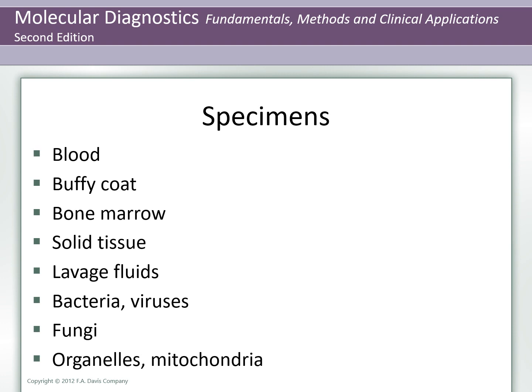Fresh or frozen tissue samples must be dissociated before DNA isolation procedures. Grinding, homogenizing, or mincing tissue are methods to disrupt the whole tissue. Fixed and embedded tissues that are processed in histology may be deparaffinized by soaking in xylene. The DNA quality depends on how the tissue is handled prior to fixation.